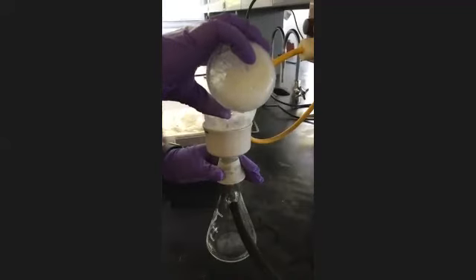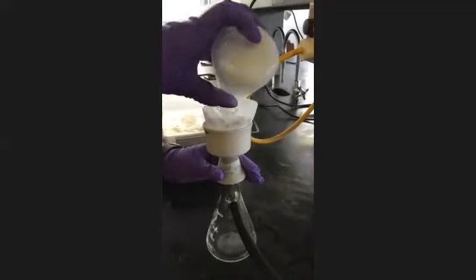So get all the solid on there that you can, and anything you can't get, just turn it over and tap it.